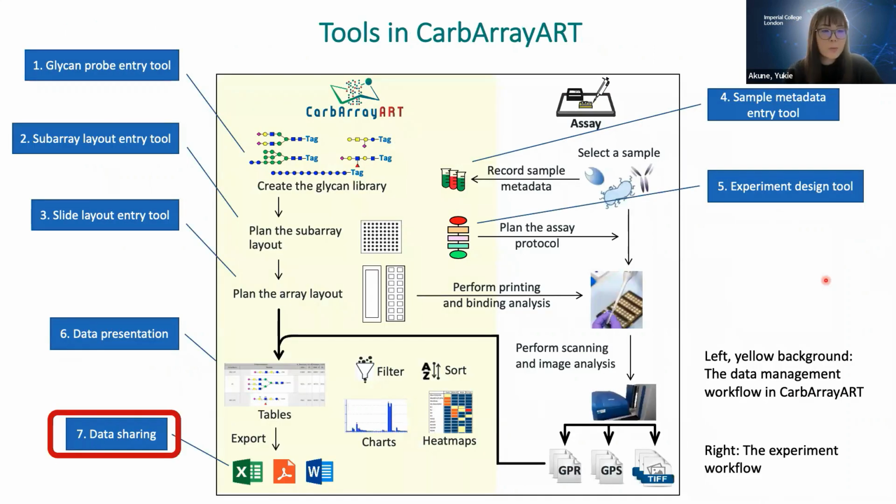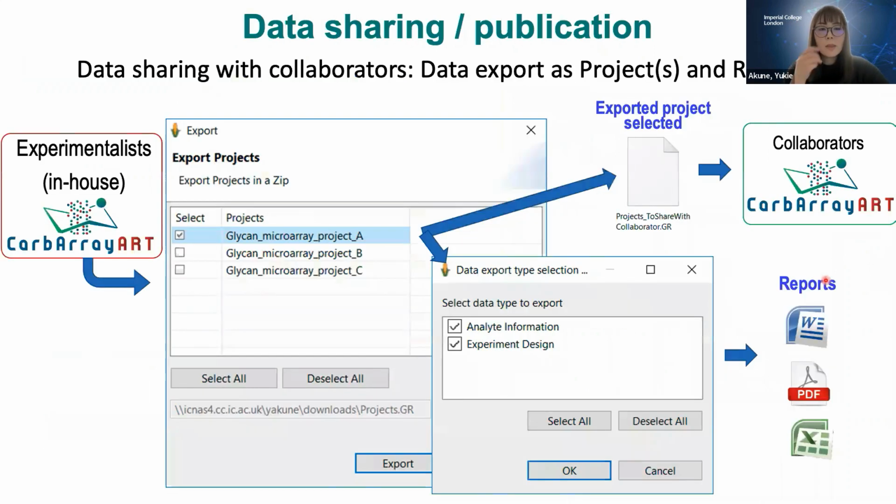The last part is data sharing. In CarbArrayART, you can share the data by selecting the project.